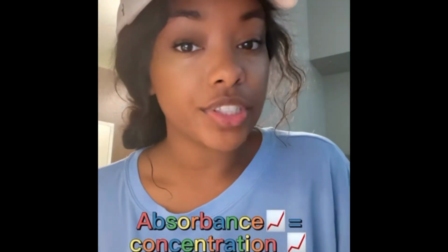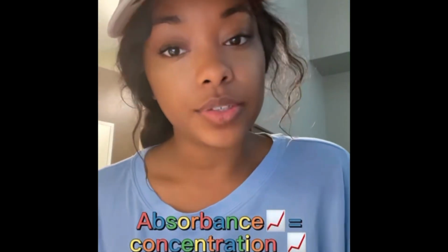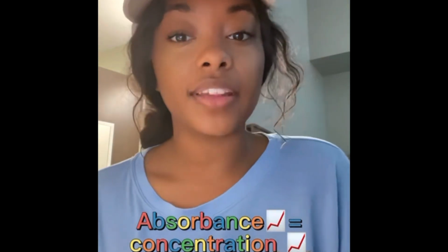Absorbance is directly proportional to concentration. The more concentrated a solution is, the more radiation gets absorbed, therefore the higher the absorbance. When using a spectrophotometer, it is very important to zero the machine using a blank cuvette. This is because the absorbance value will now be at 0 and will set a basis for the rest of the dilutions to be compared to.